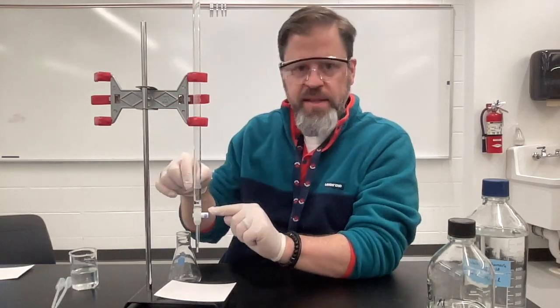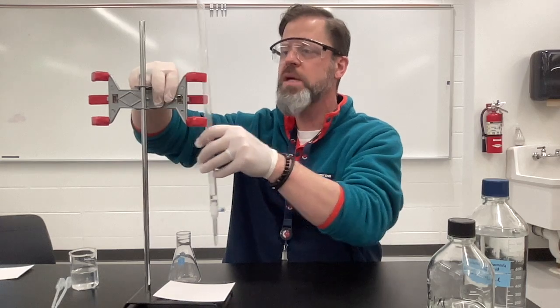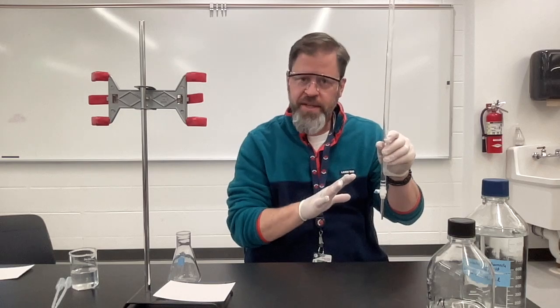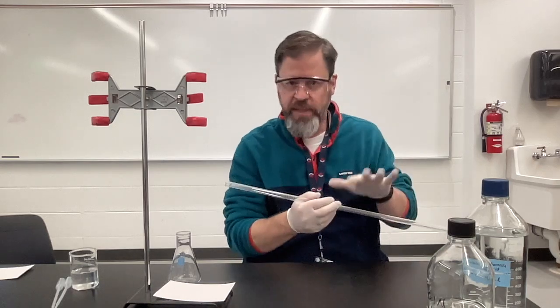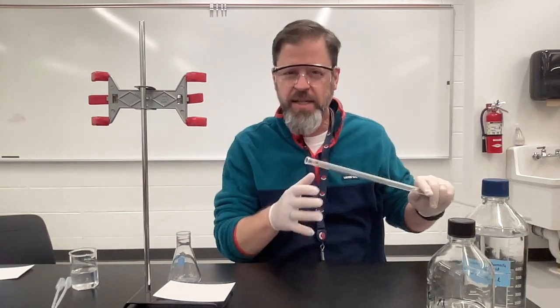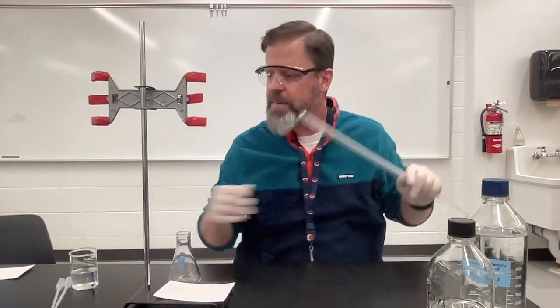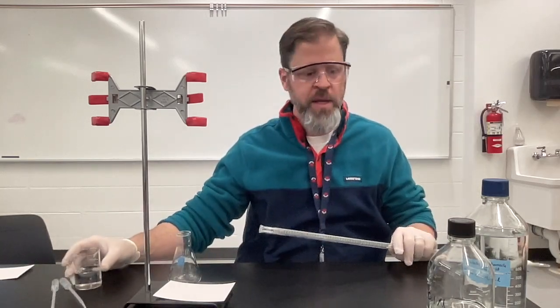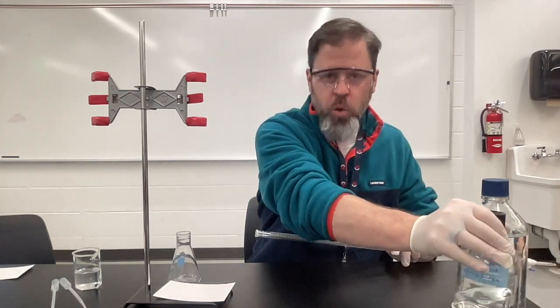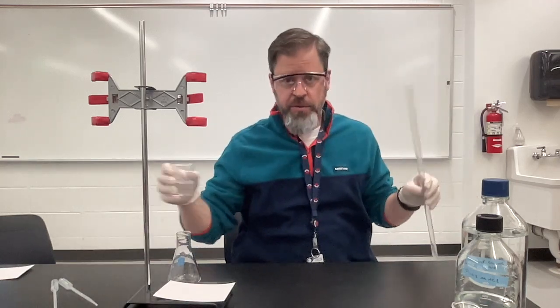The burette has a little valve down here that I'm going to be able to open and close. I have pre-washed and rinsed it with the actual chemical that I'm going to be using. You put your chemical in and rinse it a little bit so that you don't have any leftover water that might accidentally dilute your sample. I'm going to put my 0.1 molar sodium hydroxide up here in the burette.